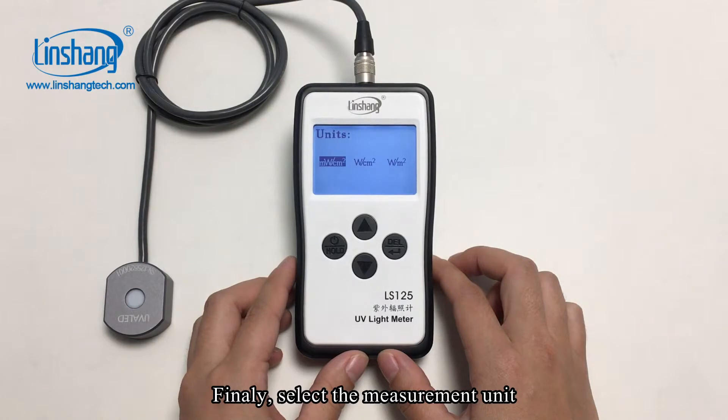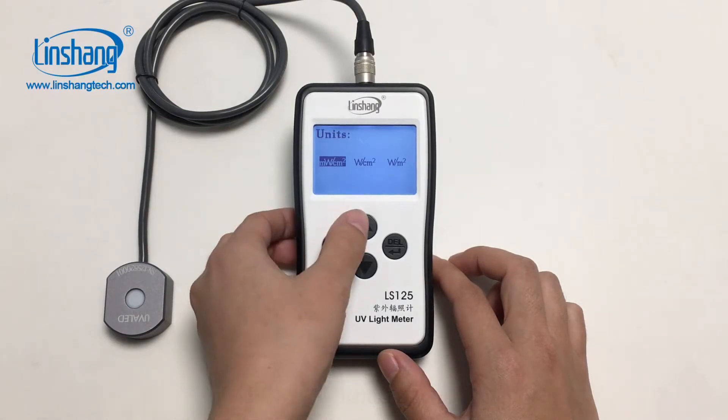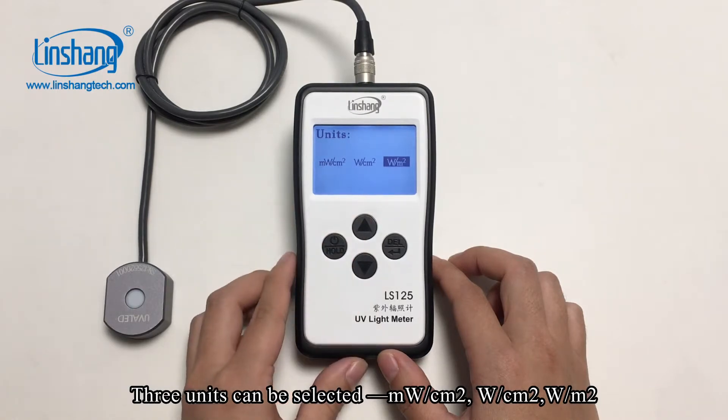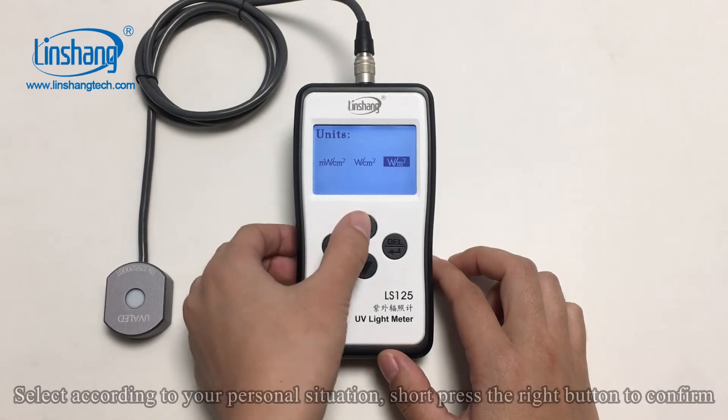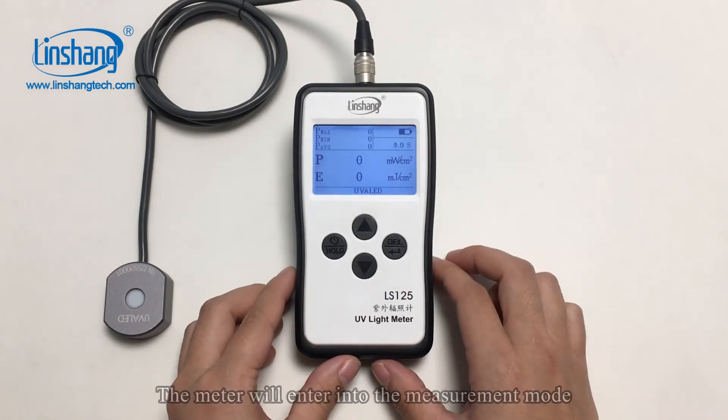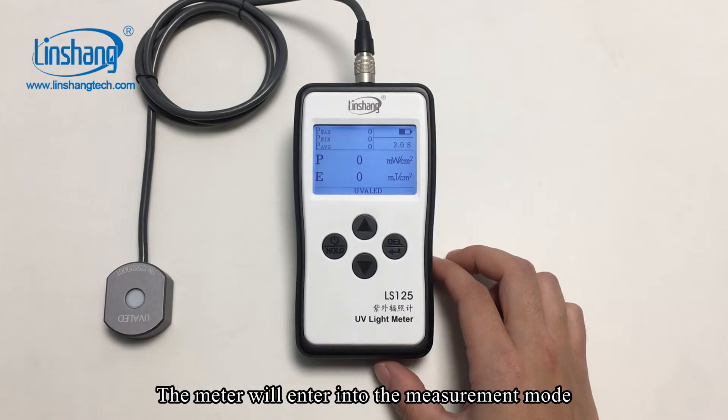Finally, select the measurement unit. Three units can be selected. Select according to your personal situation and short press the right button to confirm. The meter will then enter into the measurement mode.